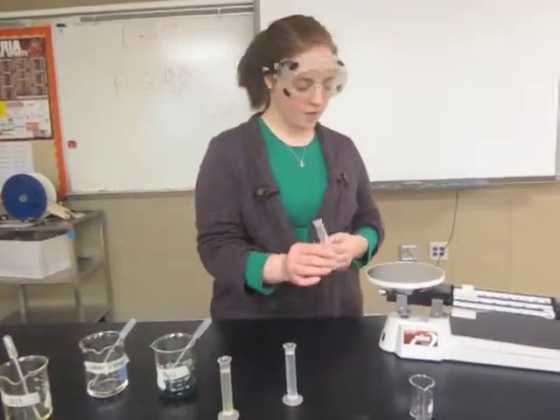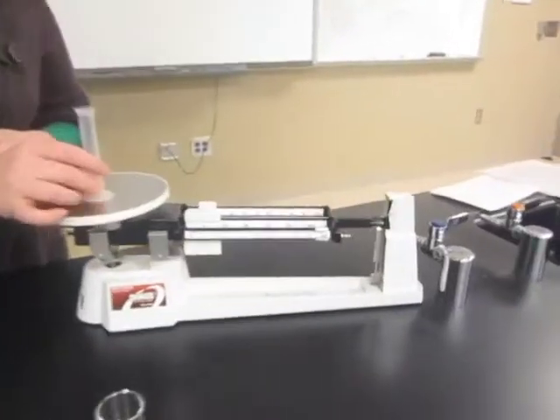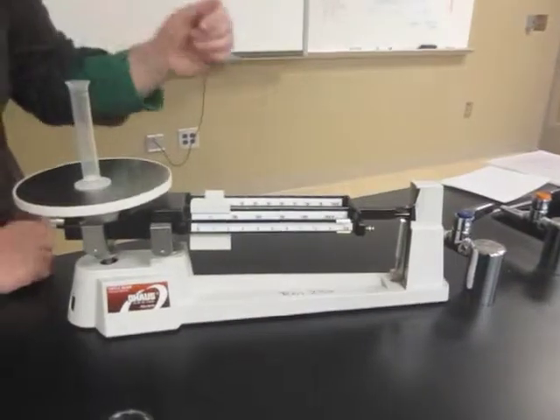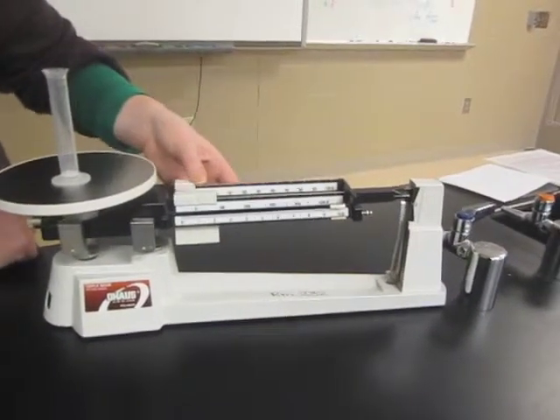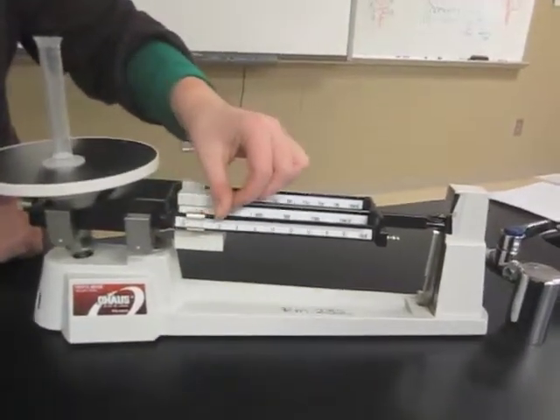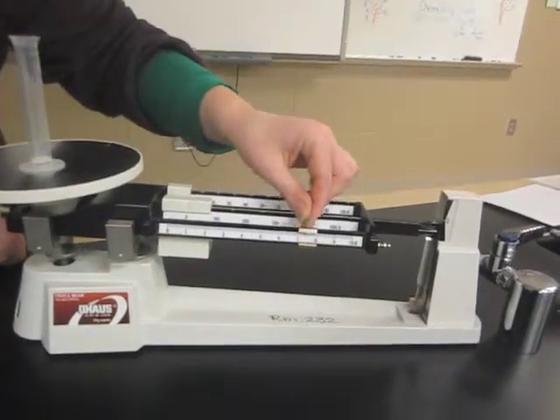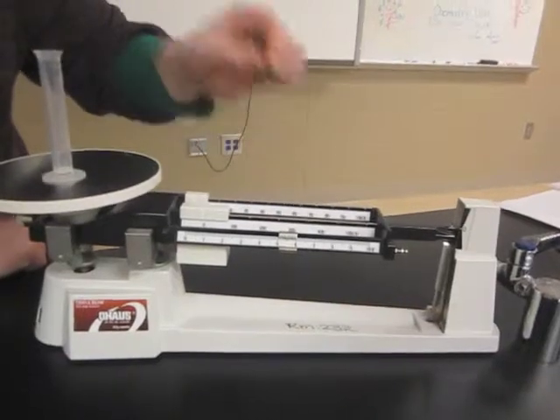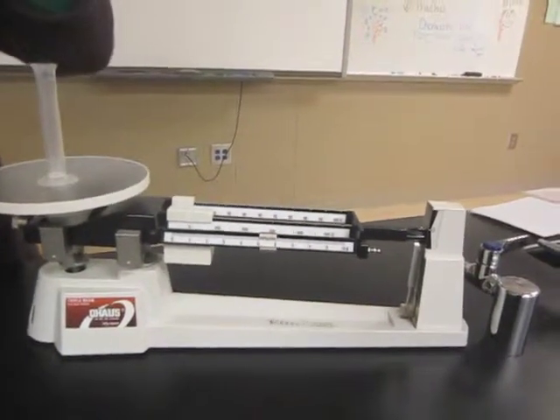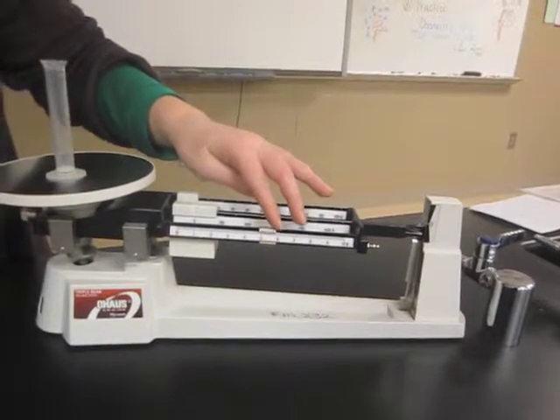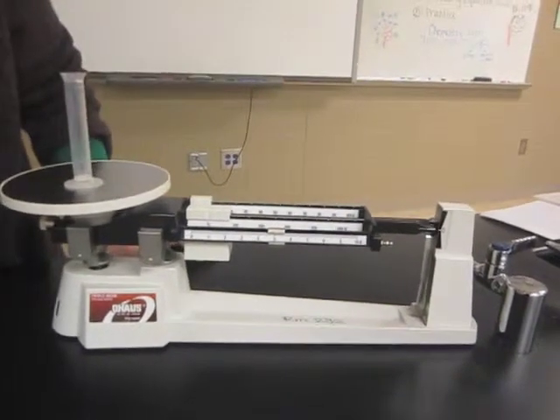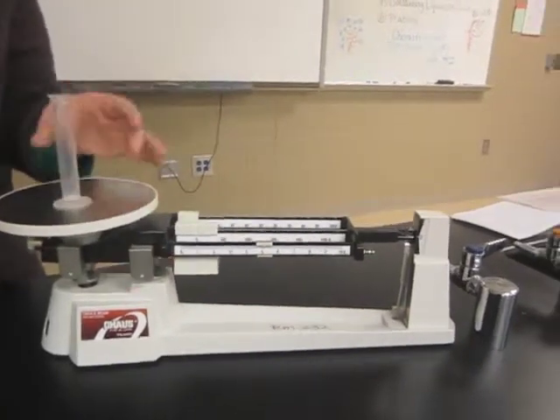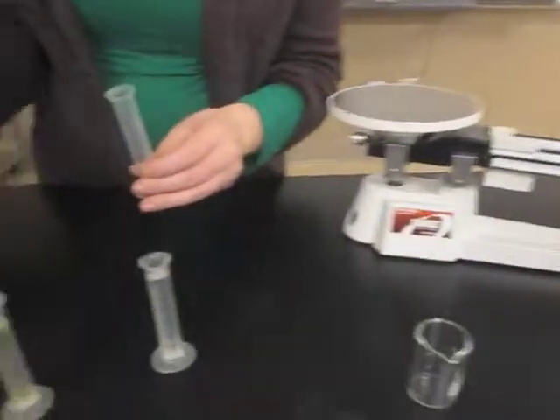Then you need to repeat the process one more time for your water. Note that the water is only green because it has been dyed. Find your empty mass of your third graduated cylinder — it should be approximately the same as the others, about 5.2 grams — and then fill it with 10 milliliters of water.